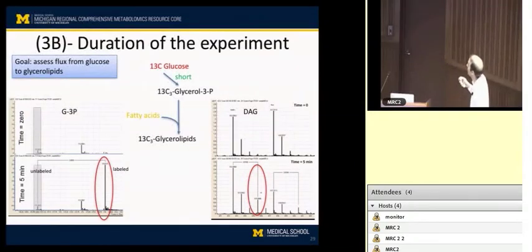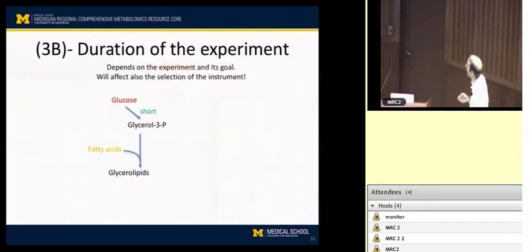And so within a short period of time, you can see a shift of diacylglycerol here. So this is a diglyceride. You can see a shift of the isotope distribution from the natural isotope to a +3 distribution, and that corresponds to incorporation of this 13C3 glycerol phosphate.